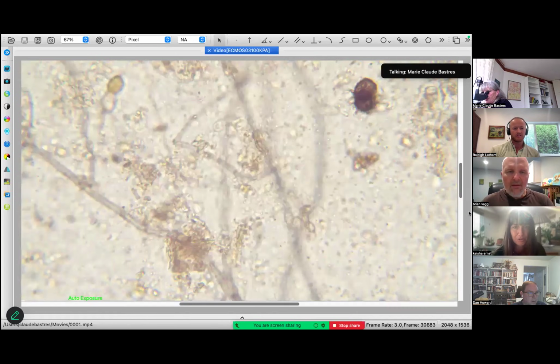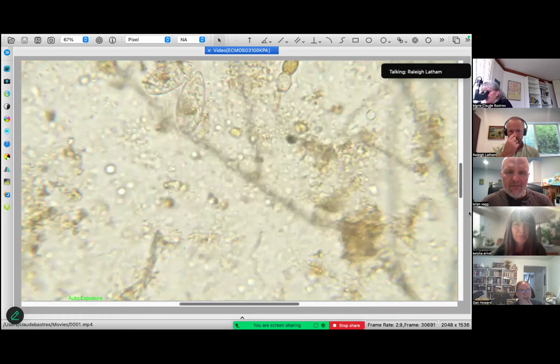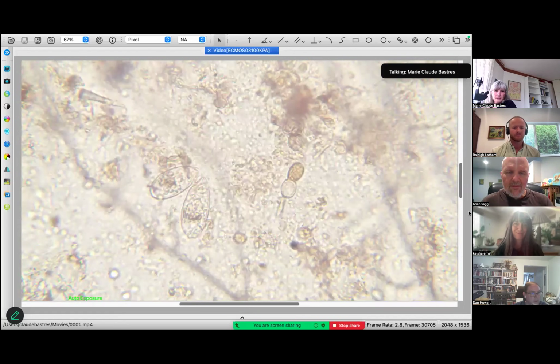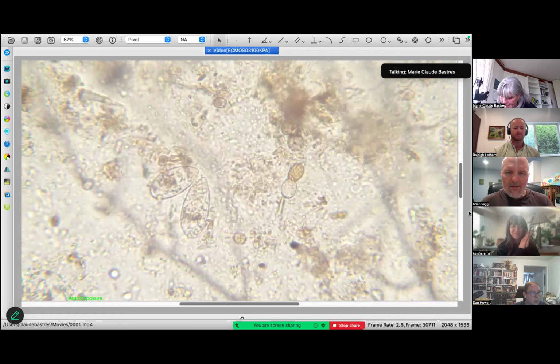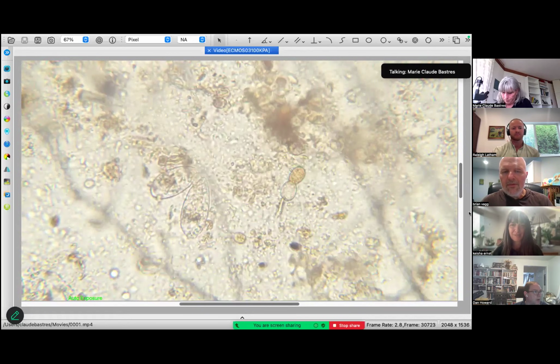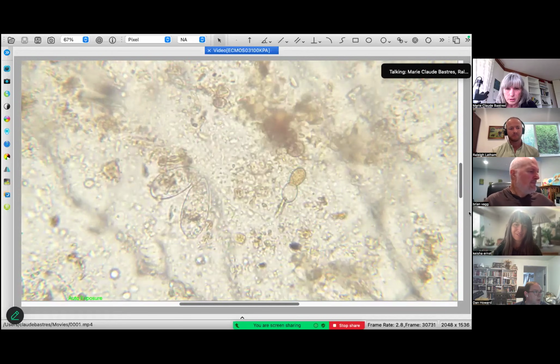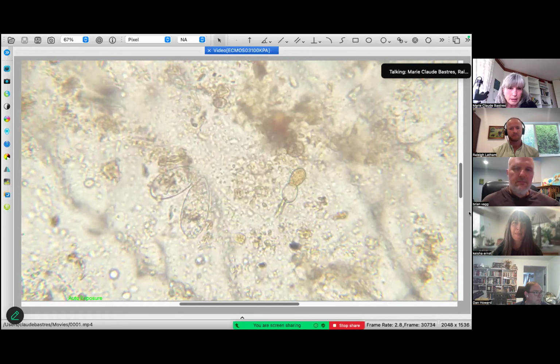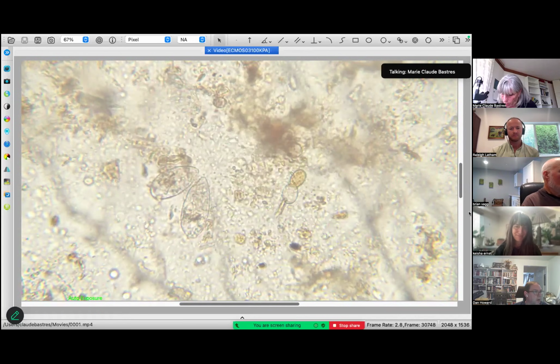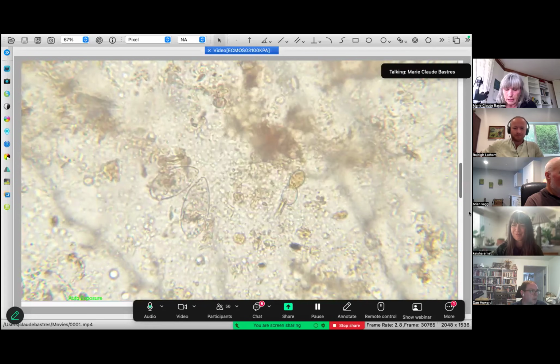So Marie, is this a compost you made in your backyard? Is it a vermicompost? Yes, this is a compost. There are two kinds of testate amoeba there. It is a compost that I made in May, which is our autumn. It is a thermophilic compost, and it had lenga bark, which is a native tree, a kind of Nothofagus. Orchard waste, mainly brassicas, because that's what it grows outside here.